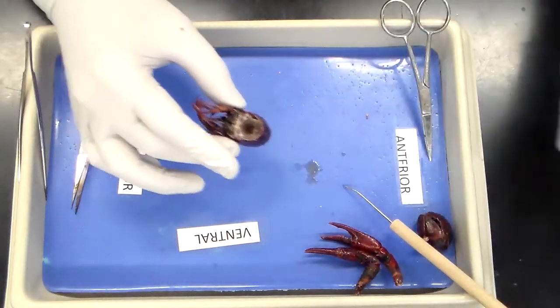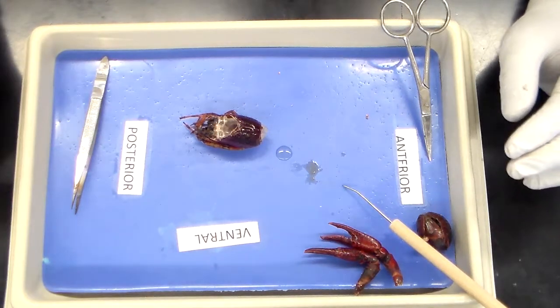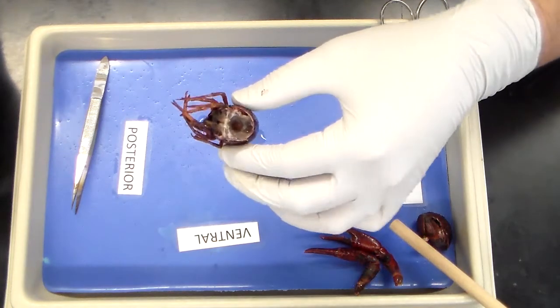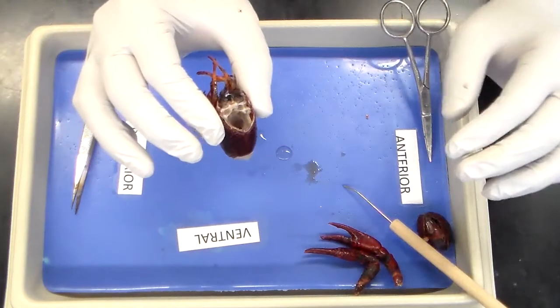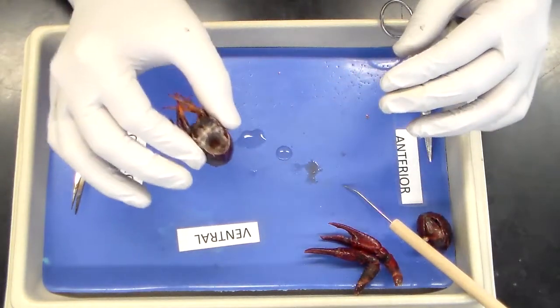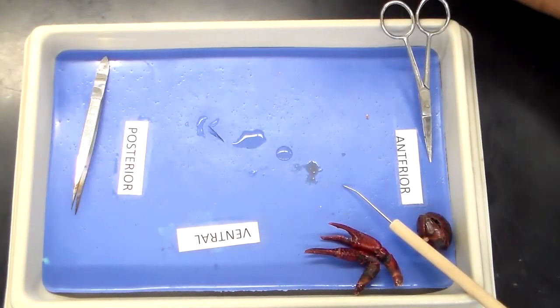Now that we've examined the internal structure inside the head, we're going to go ahead and focus more on the internal structures in the thoracic region. We removed our cavity from saline solution, and I'm going to look at this underneath the dissection microscope to see if I can still see the heart beating.